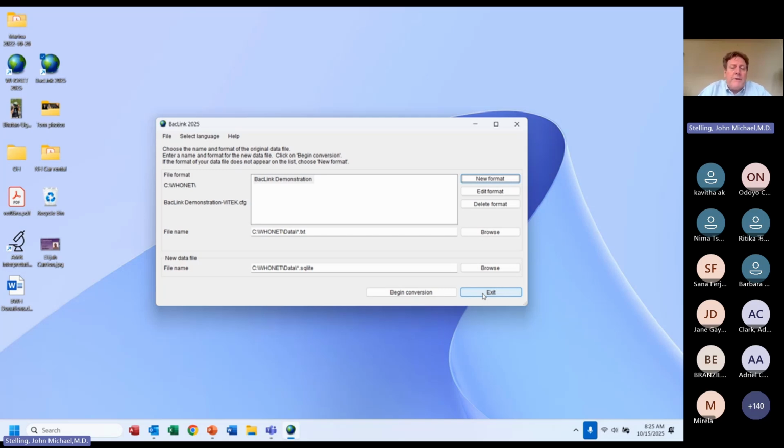SILAB and SunQuest, they're all the same way. You don't have to do the mapping because we have done the mapping for you. On the other hand, if you have Excel, then text files, then you have to do the mapping yourselves, and I will get to that.